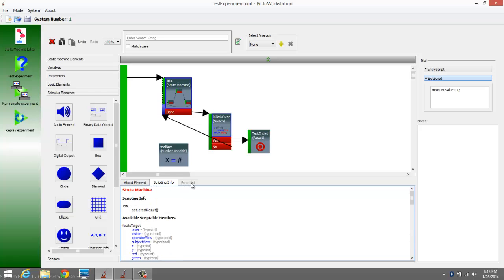And then this other tab here is grayed out right now, and the reason for that has to do with compilation. Once we've finished designing our experiment, we can click here to check the current experiment's XML code for syntax errors. The error list pops up. If we don't have any errors, then we'll have syntax check passed, and that tells us we're ready to run the experiment.